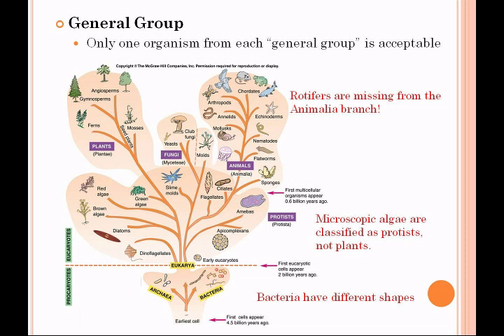You can see with the bacteria that there are different shapes. So a general group for a bacteria would be bacillus, or rod-shaped, or coccus. These are terms that you learned in the first lab. So think back to what Escherichia coli looked like and then classify it in the general group. Was it a rod-shaped bacterium? Was it a coccus or a spirillum-shaped bacterium?